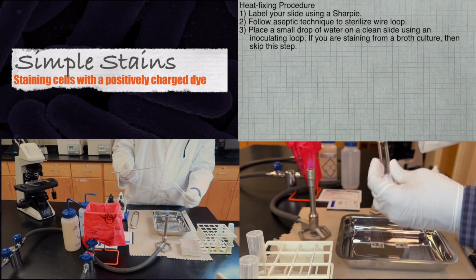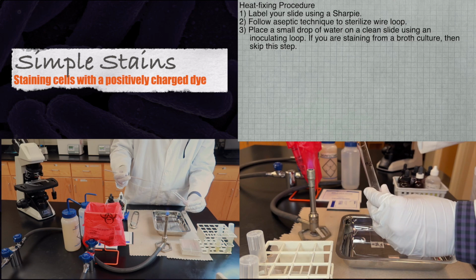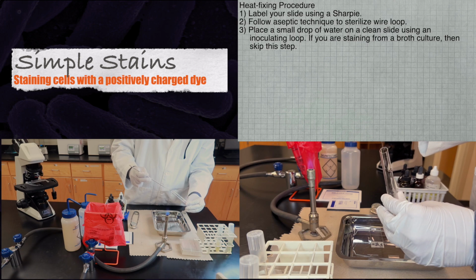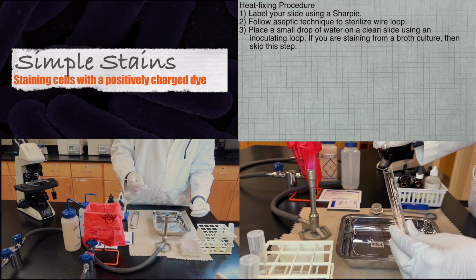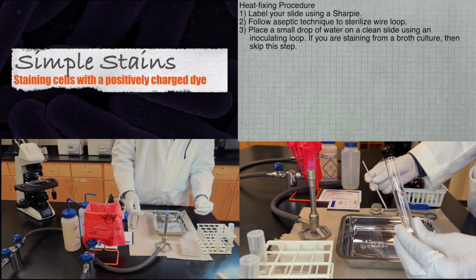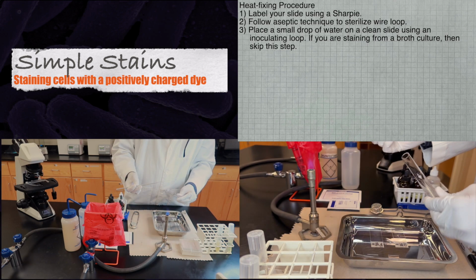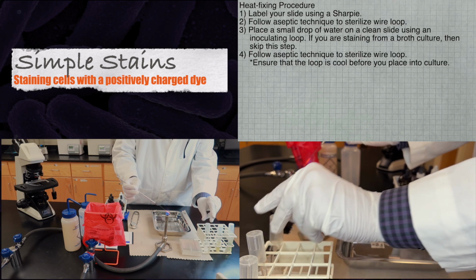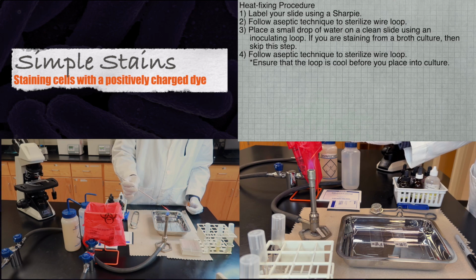Next, please pick up a small droplet of water using your inoculating loop and place that droplet of water on a clean slide. If you are starting from a broth culture, then please skip this step. Follow aseptic technique to sterilize your wire loop and ensure the loop is cool before you place into your bacteria culture.